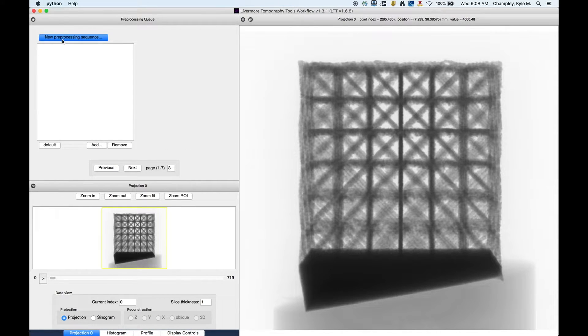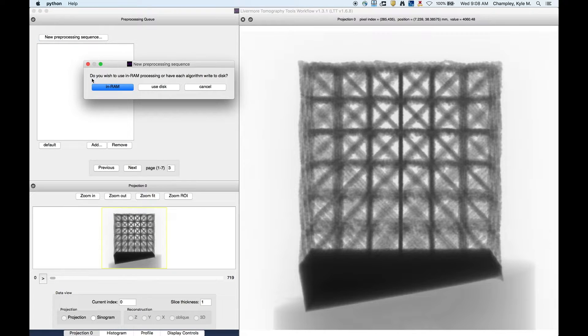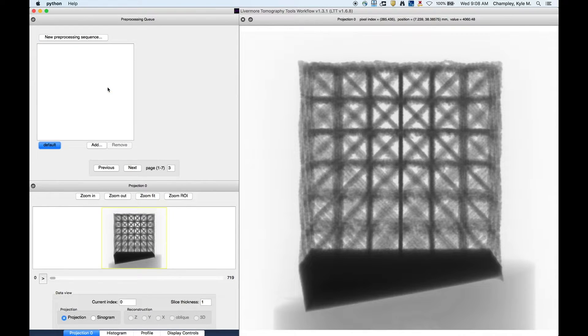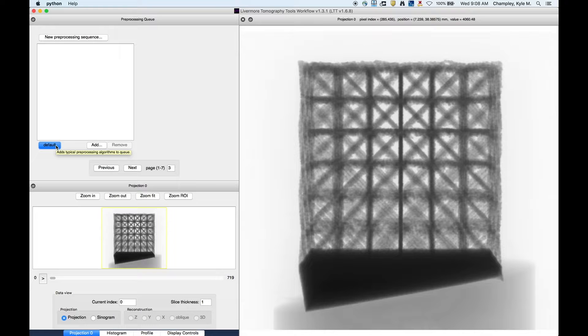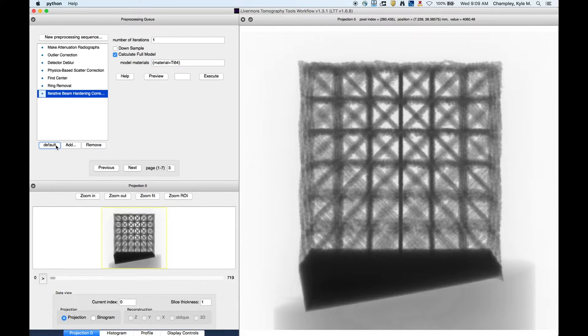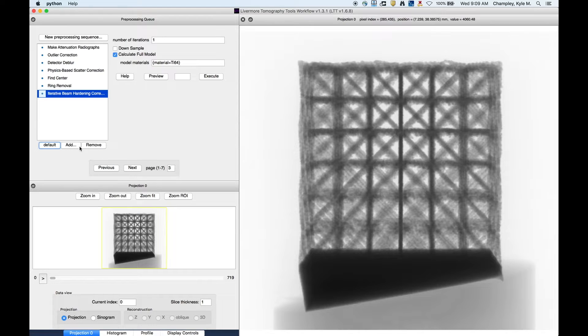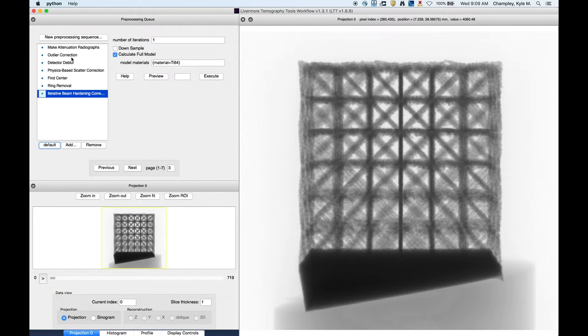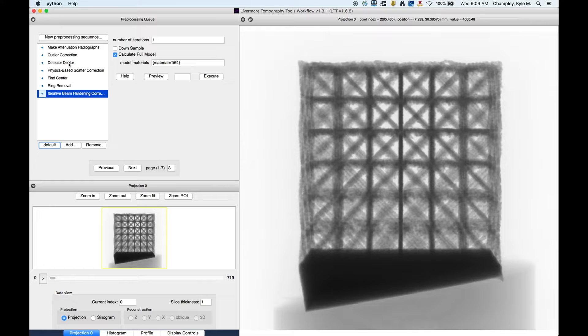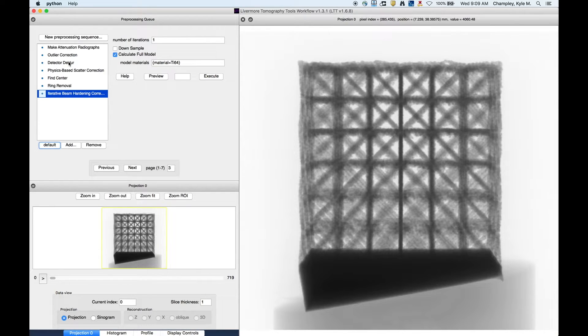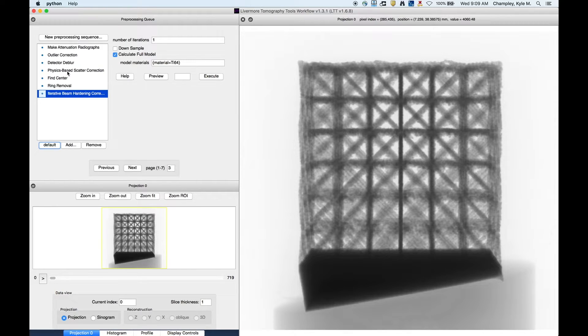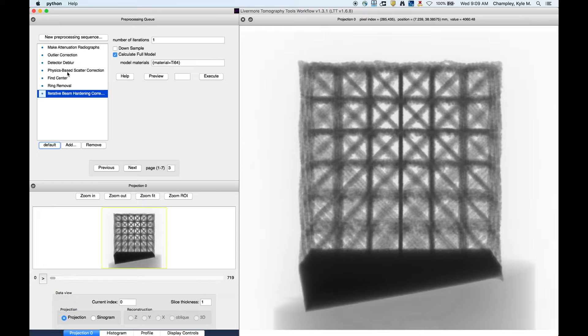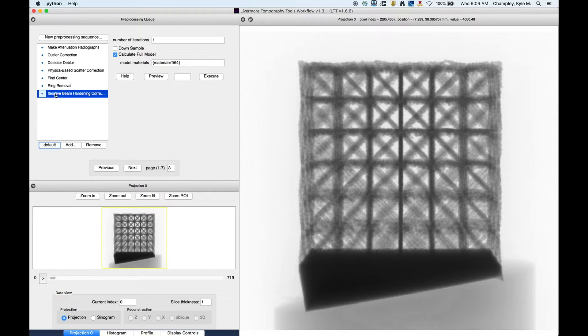Now I'm going to say new processing sequence. We'll do in RAM. Now, since we've specified the spectra and the material, if we click default, it's going to automatically populate these fields with the physics-based chain. So you see some new ones here. We have detector deblur, and it went ahead and put that one in the chain because we specified a detector blur file. It also put in a physics-based scatter correction because you gave it the spectra and the material to see. And it also put in the iterative beam hardening correction.